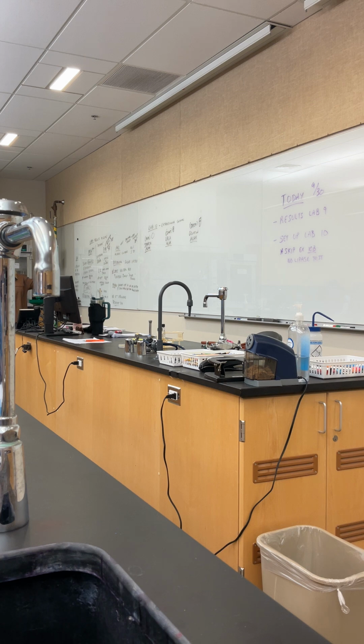All right, so hopefully this makes sense as we're going through. Now, questions that I like to ask. What makes MacConkey selective? What makes MacConkey differential? What makes mannitol salts selective? What makes mannitol salts differential? What should Staphylococcus aureus look like on mannitol salts? What should Staphylococcus epidermidis look like on MacConkey? It shouldn't grow, right? Those are the kinds of questions you want to ask yourself as you're studying. Making sure that you're understanding why we're using the media, what it's doing for us, and how it's helping us.